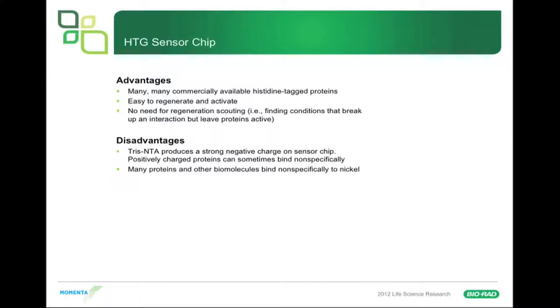Disadvantages: Tris-NTA produces a strong negative charge on the sensor chip, so positively charged proteins can sometimes bind nonspecifically to the Tris-NTA due to that strong carboxylic acid group. But the real disadvantage is that many, many proteins and other biomolecules bind nonspecifically to the nickel — that's what has kept this from being adopted more widely. To try to alleviate nonspecific binding to Tris-NTA, you can try adding surfactant or increasing surfactant concentration, or adding magnesium chloride to your buffer — but don't use PBS in that case, as you can get precipitates.